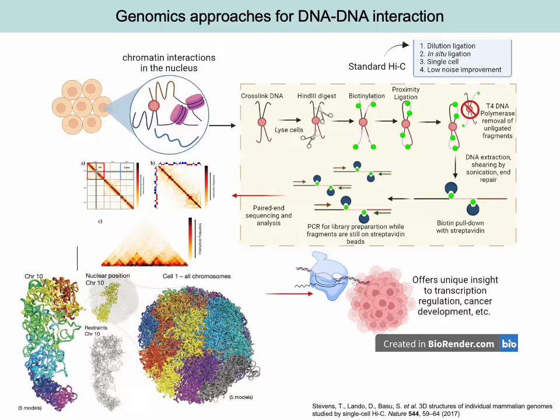In that way, we align back to the chromosomes, and then we can generate a contact map of which locus is in contact with which other one, and through a computational model, we can reconstruct what the nucleus looks like. And of course, this requires a lot of computational resources and power, and this is usually done on bulk data. But most recently, there has been a lot of improvement of this technology.